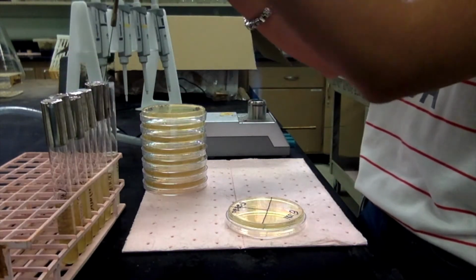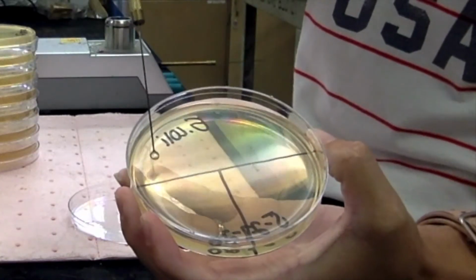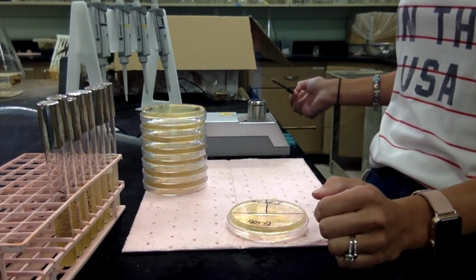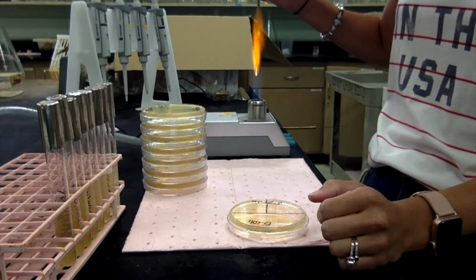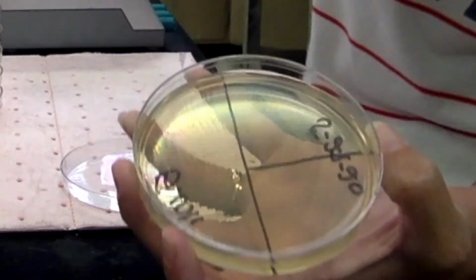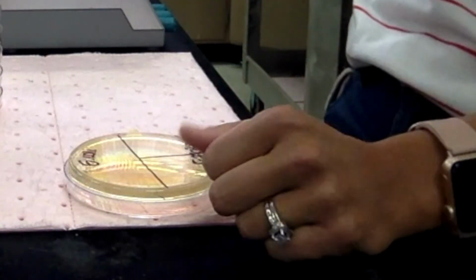My first bacteria is going to be E. coli, so I'm just going to dip in once. Then I'm going to streak in the first quadrant back and forth. Then I'm going to flame my loop. Now my other loop is already cool, so I'm going to drag over twice to pick up some cells, then stay in quadrant 2, flame my loop.